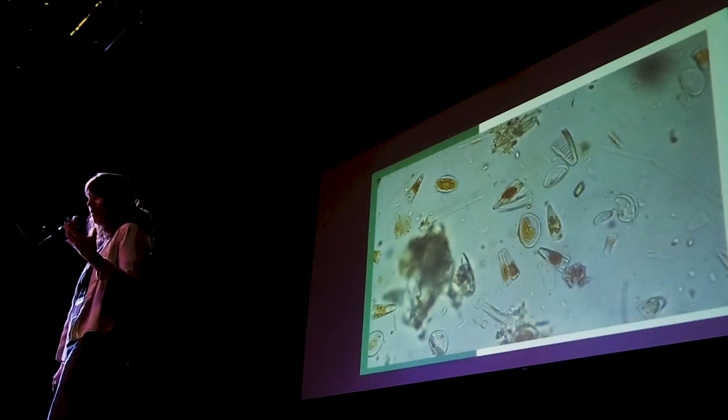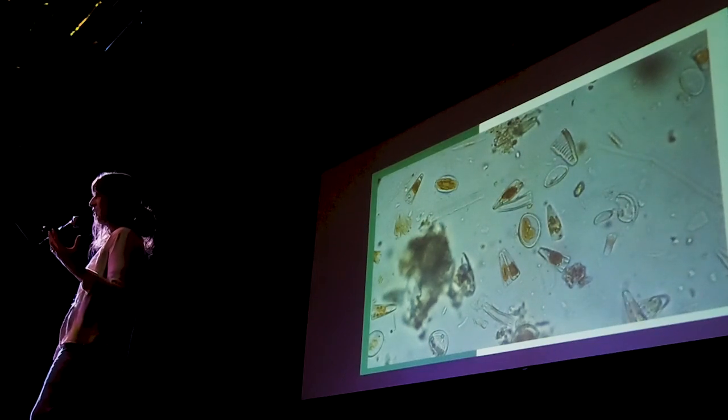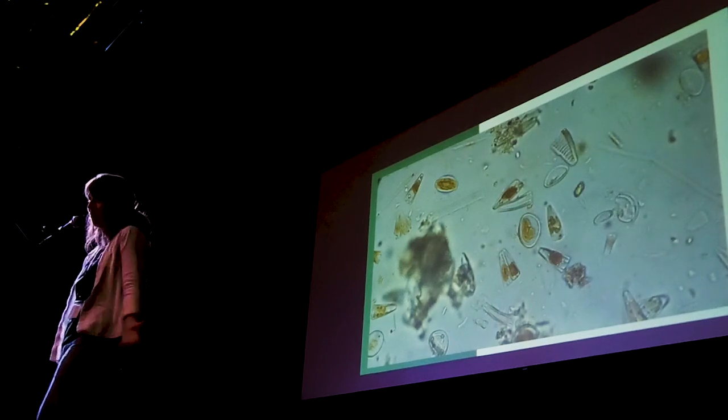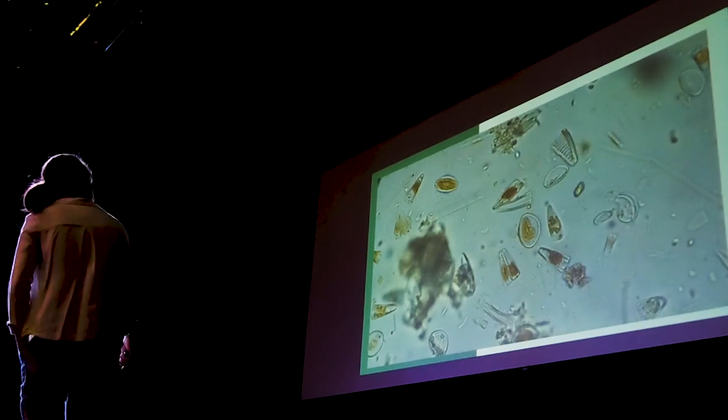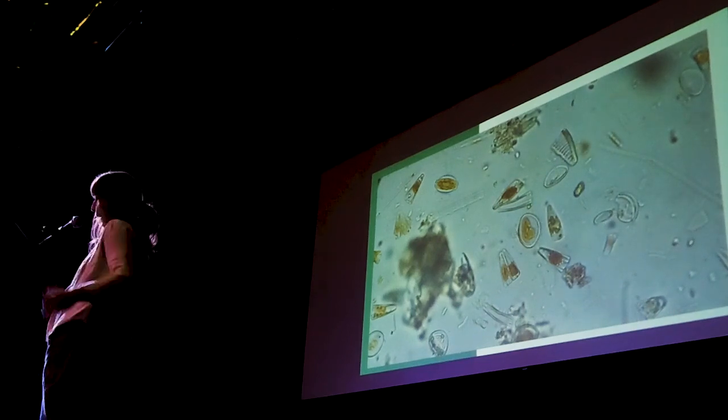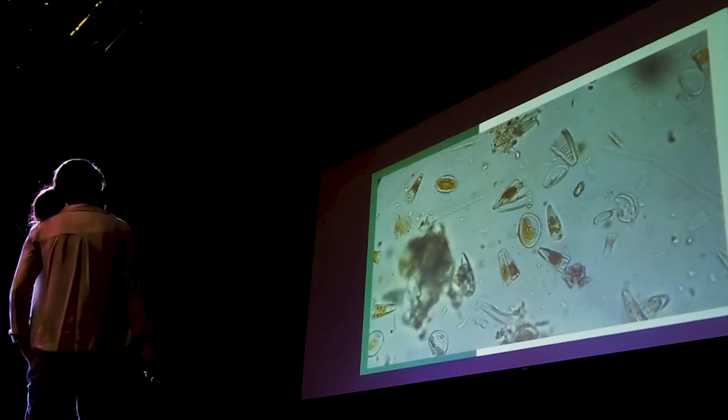That color that you see, that orange and yellow, that means they're photosynthetic just like plants. So they can take sunlight and convert that into energy and food. And yeah, they move. They move around a lot. You wouldn't think diatoms move, but they wiggle and shake.